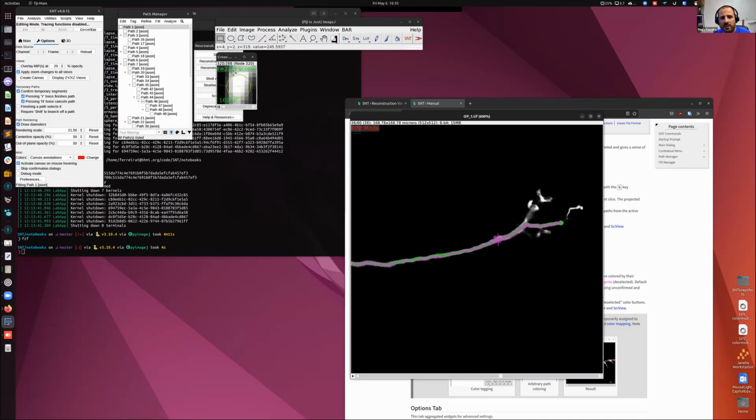That's pretty much the idea. Then you see there is a statistical test that is performed, and a score to know accuracy. If you are too far off, you can abort the snapping operation, or you can decide what to do. So that's one option, and that's how you go from center lines to a path with thickness.